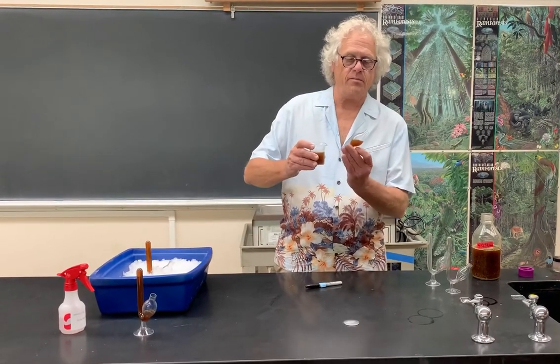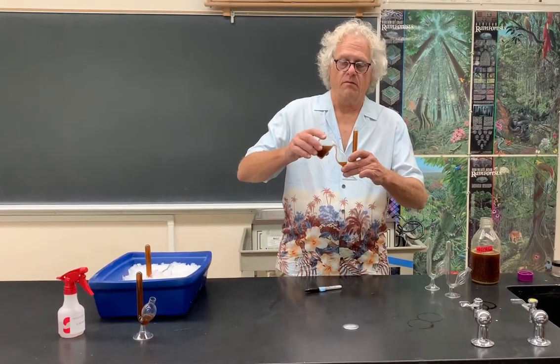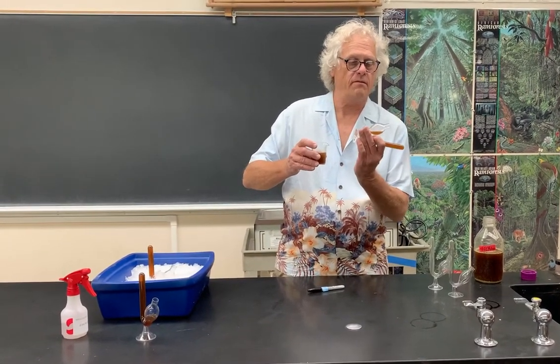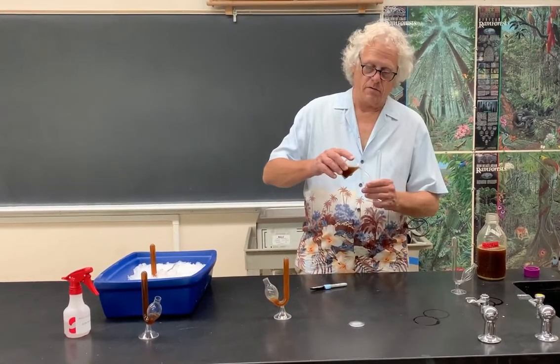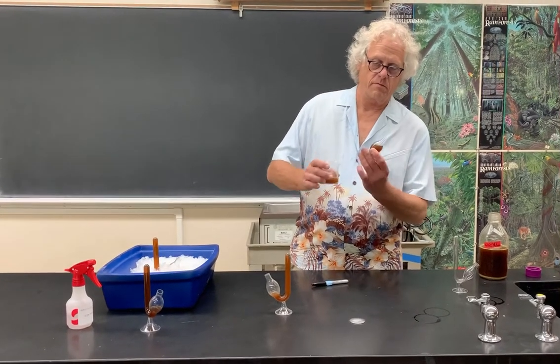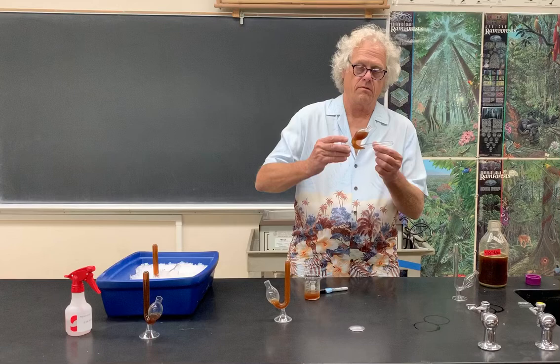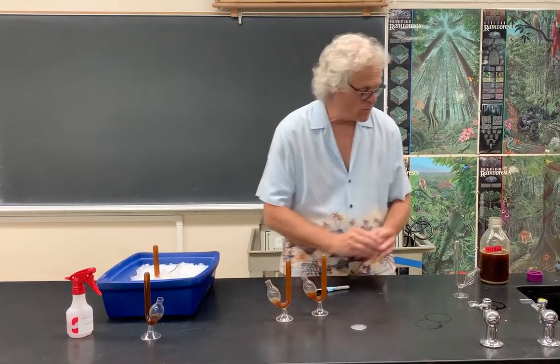And fill these 3 up the same way. No air bubble at the top. There's one. Here's another. A little bit more here.